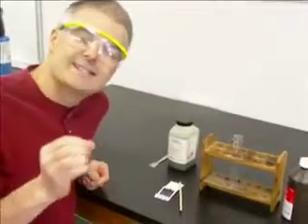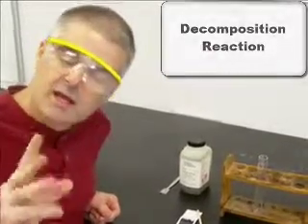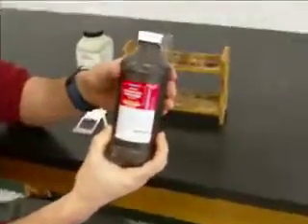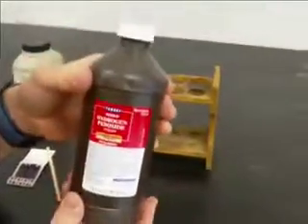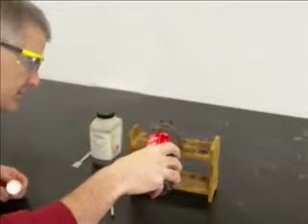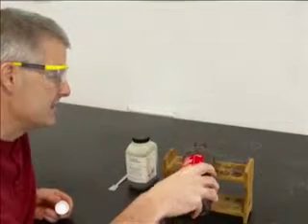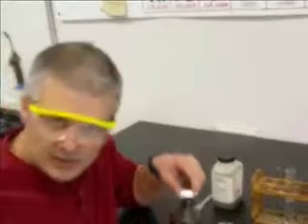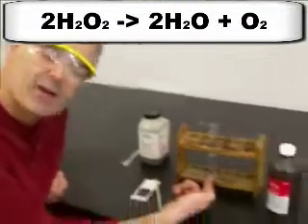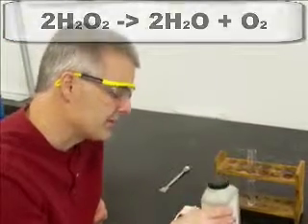All right, I want to show you today a decomposition reaction. Now remember, a decomposition reaction, you start with one thing, and it breaks apart into multiple things. So the chemical I brought with me today is hydrogen peroxide, okay? This is the stuff that you can just buy at City Market or King Soopers or whatever your local grocery store is. I'm going to pour that into a test tube. Now hydrogen peroxide by itself decomposes into water and oxygen gas. So it's actually decomposing right now, but it's a very, very slow reaction. So I'm going to add something to it that should speed up the reaction.